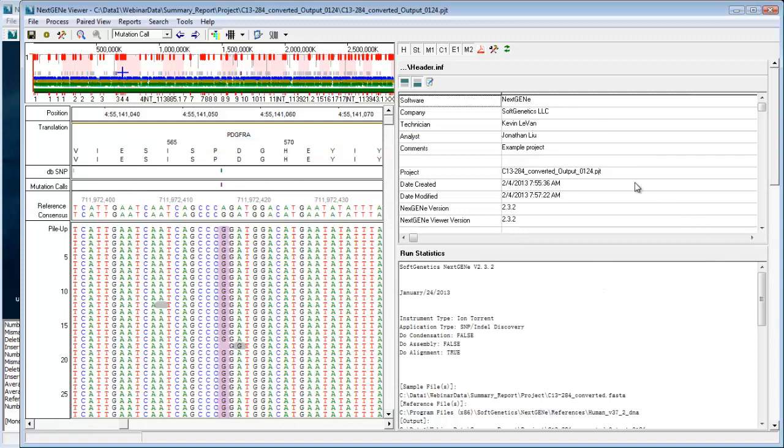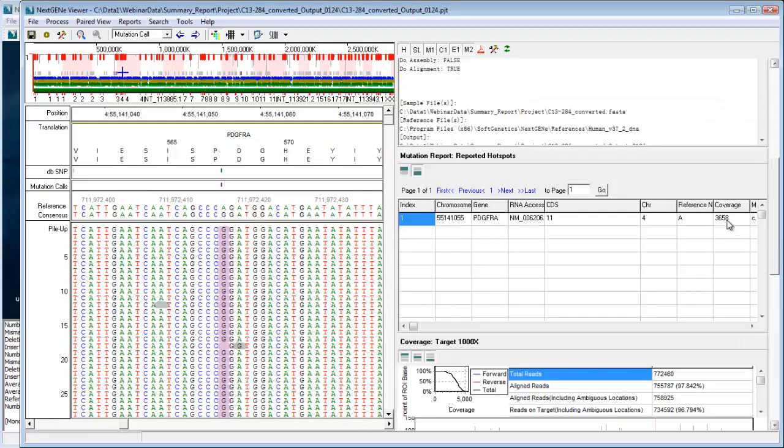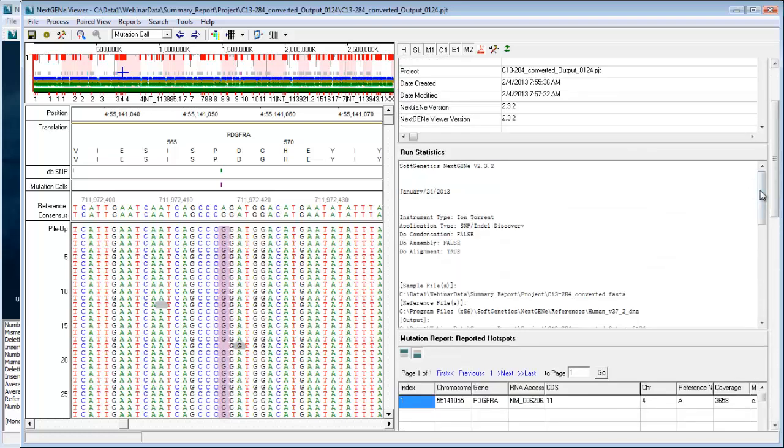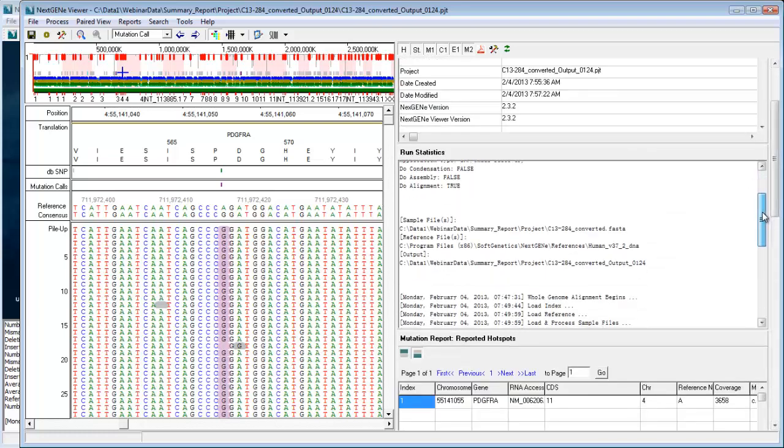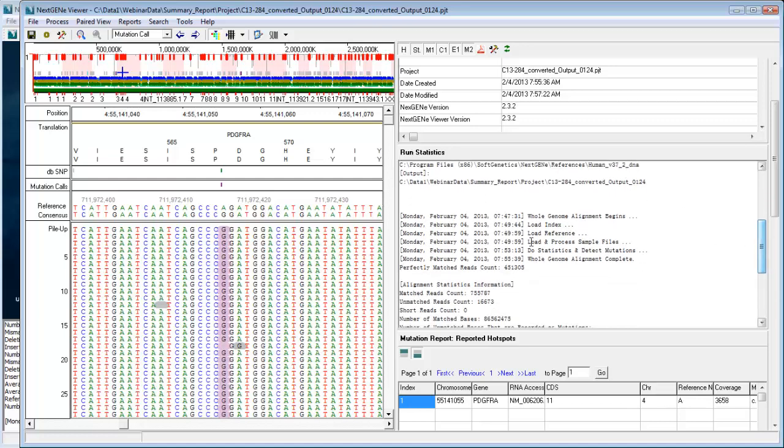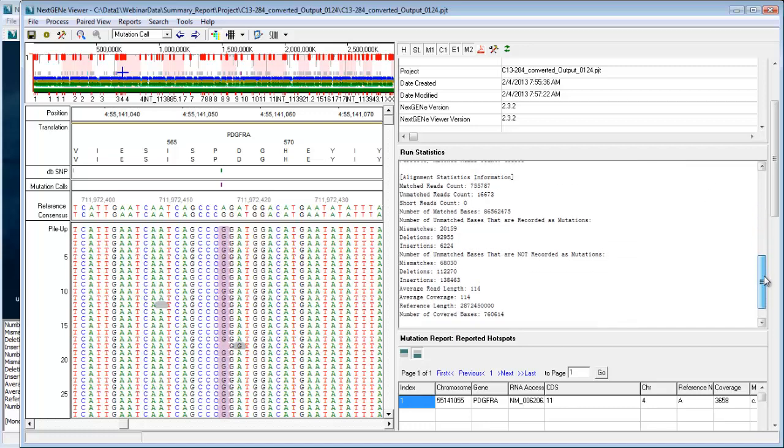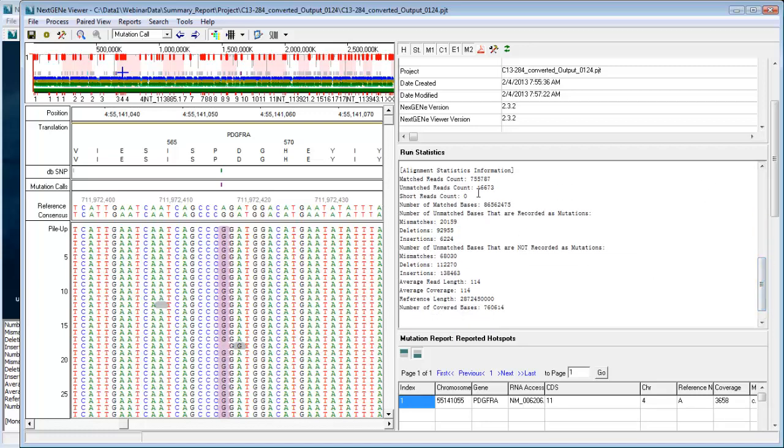Below the header section is a statistics section, which includes a lot of information about the run, including exactly what sample files were used, what reference was used, some information about the run times, and then statistics about the analysis, including how many reads were aligned, how many mismatches were found.